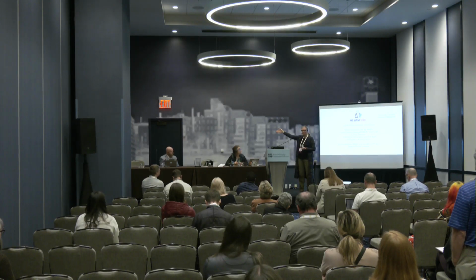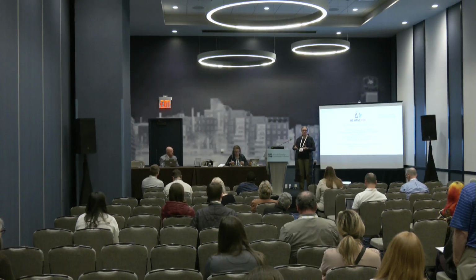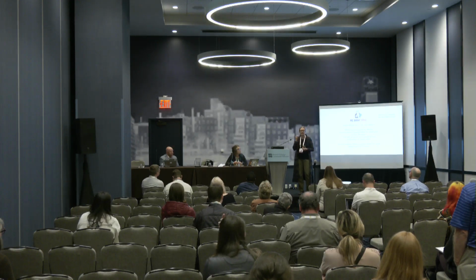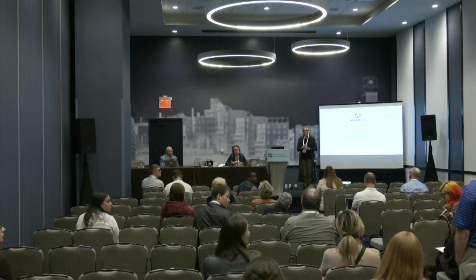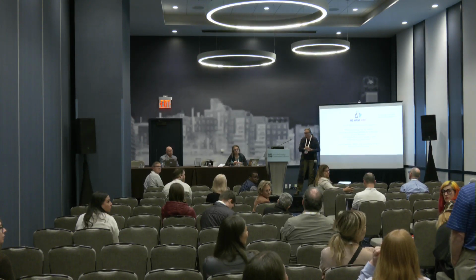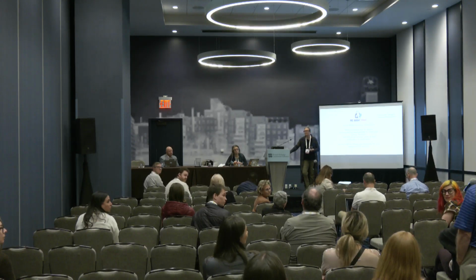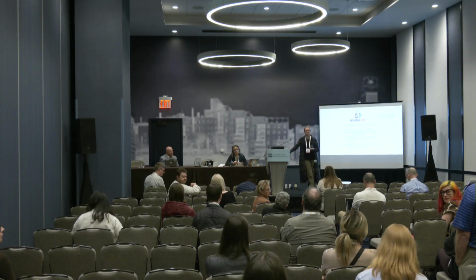There are beautiful librarians out there, right? They will give you DOIs. If you don't want to fill out the entire metadata PID instrument schema with all of the associated stuff, those are really important, but at least have that stuff recoverable. As a follow-up to that, rather than simply the serial number of the instrument, so I'm an electron microscopy co-director. If someone cares to give me the money, I upgrade the camera periodically, and therefore it is a subset of the instrument that would need to be individually identified.